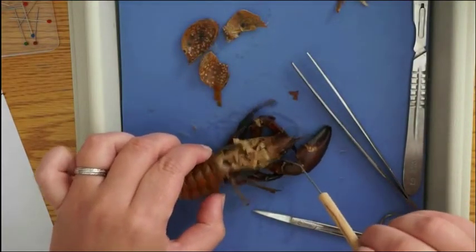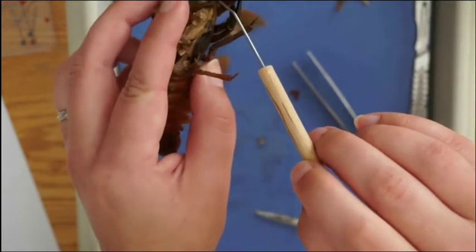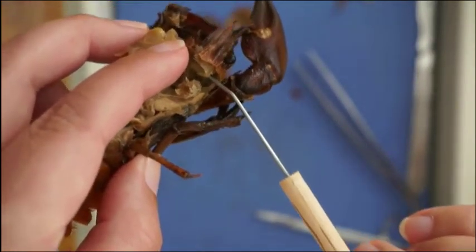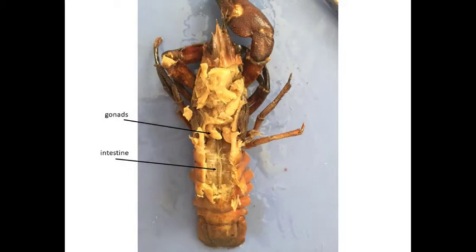Just past the stomach, towards the head, are the green glands. You really need to get down in there and find those — if you look down past the walking legs into the carapace, the green glands are right underneath there. I also dissected a little bit of the abdomen so you can see the gonads there a little bit more clearly. The intestine runs the length of the abdomen down to the anus with muscles on both sides. And that will do it for our crayfish dissection. Don't forget to do the lab questions that go with this.